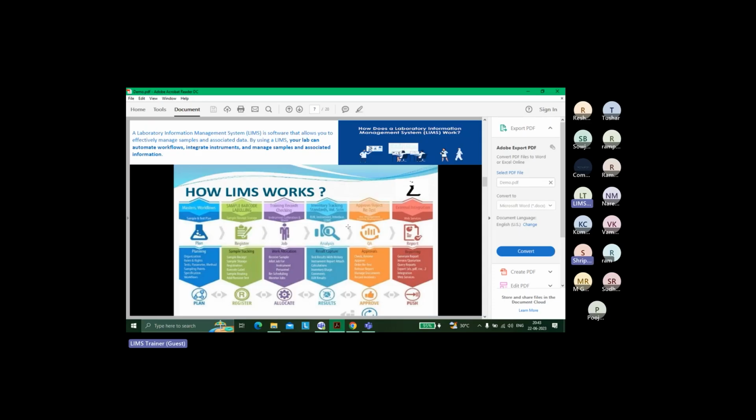Most of the time. Like in a workflow, if you create a sample, it has to be there in the above drop down menu, right? A workflow is nothing, it's just step by step automating your steps, so that once you click on this, this happens, you get everything at one place, right? You create pie charts, graphs, and you can see them. But it's just an extension, right? You are just customizing, right?